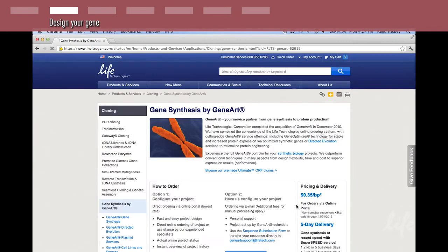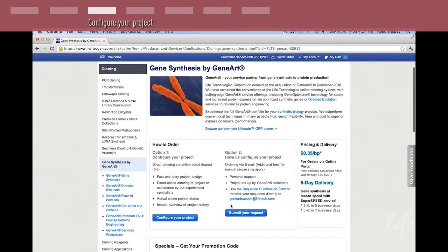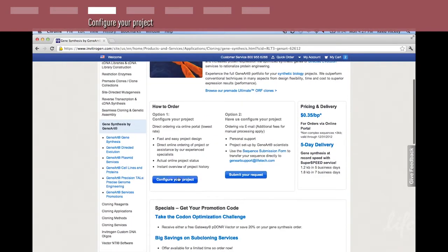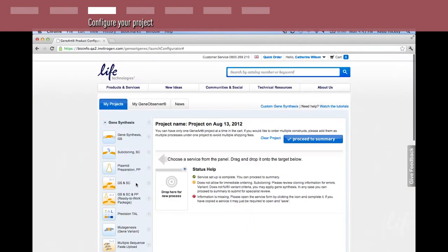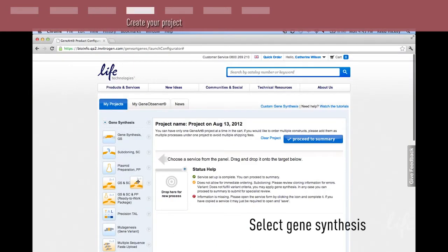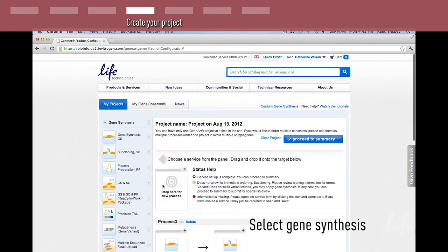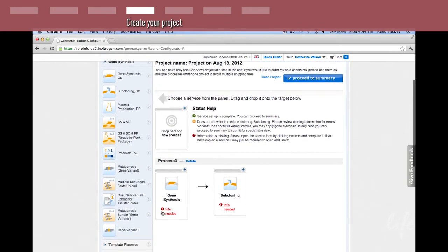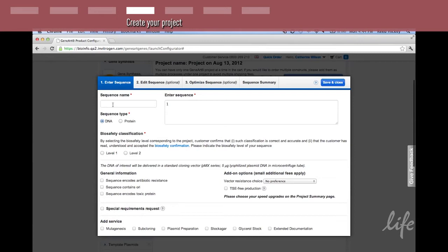From there, select configure your project. This will take you to the GeneArt portal where you can create a new project. Select gene synthesis and subcloning and add it to the new project. Scroll down for the gene synthesis icon and add your sequence.